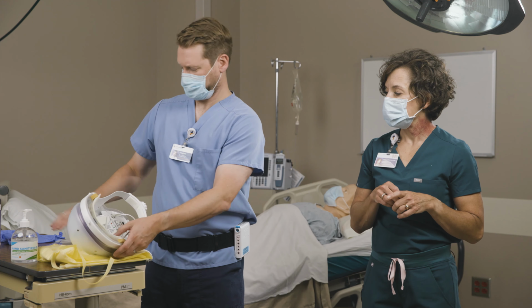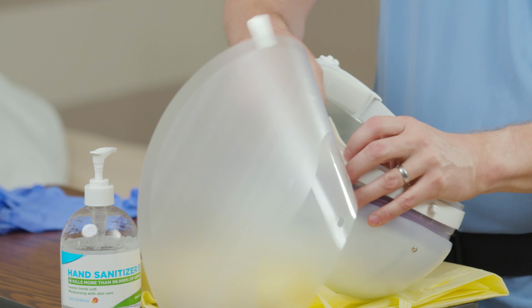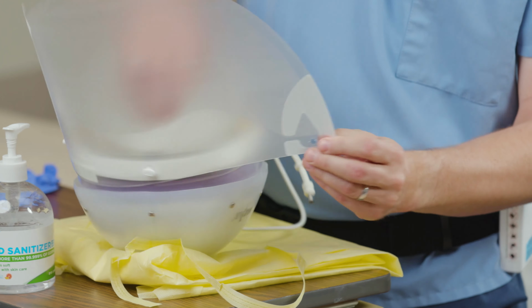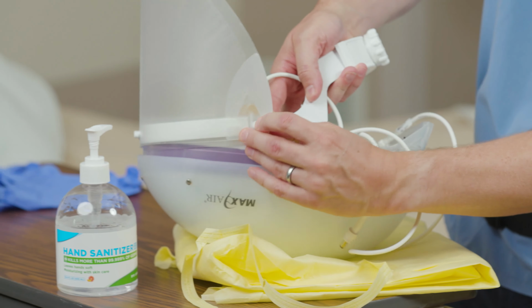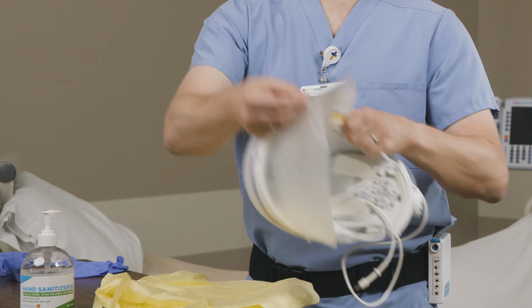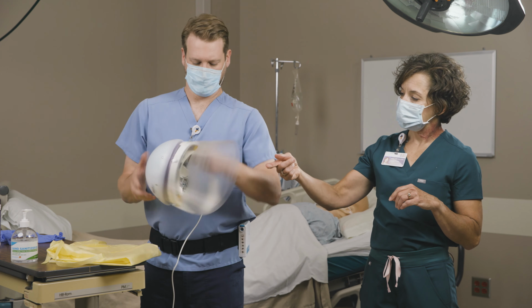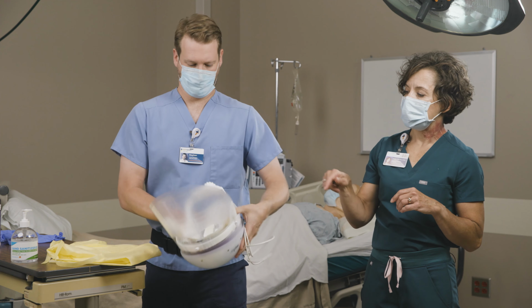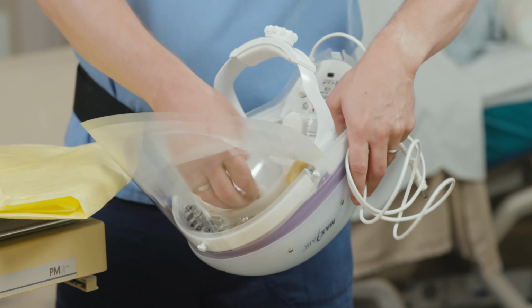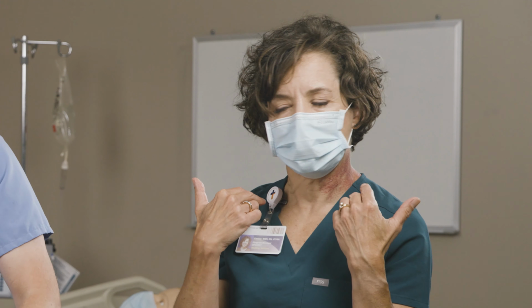Next, he's going to take his lens cuff and he's going to apply it on the sides, in the front, and then on the other side. Then at this point, he's going to remove the film off of the outside of the lens cuff. And then he's going to flip it over and he's going to loosen the plastic tabs on either side of the lens cuff. And then this just loosens that plastic film so it's easier to tuck under your chin when you don it.